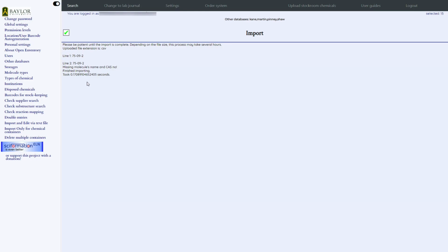This one, we only had about 12 entries, so it was very quick uploading to the server. So that's how you upload using an Excel file into Open Enventory.